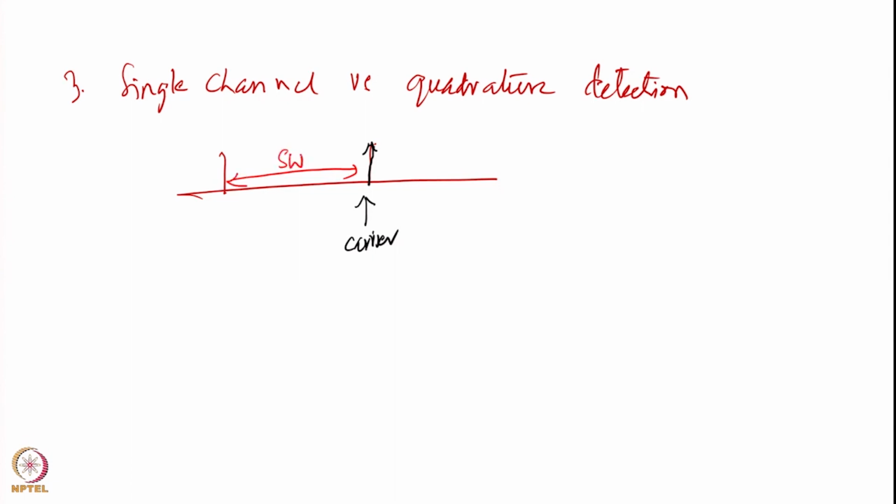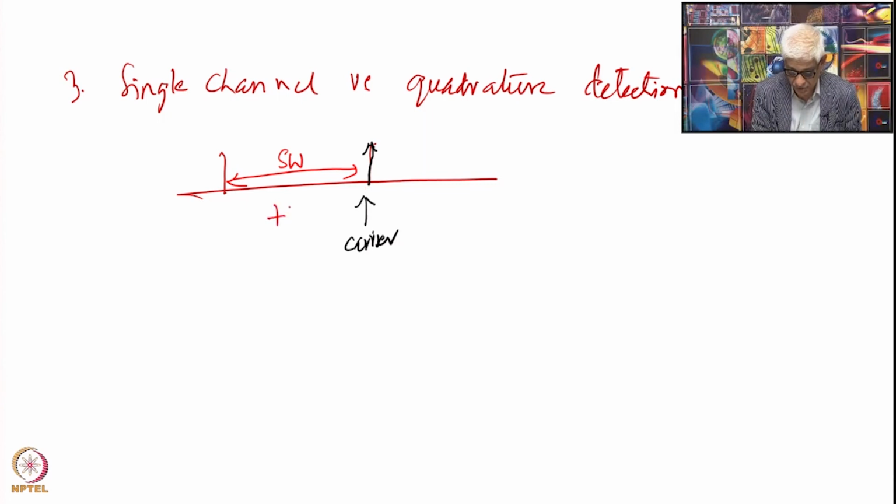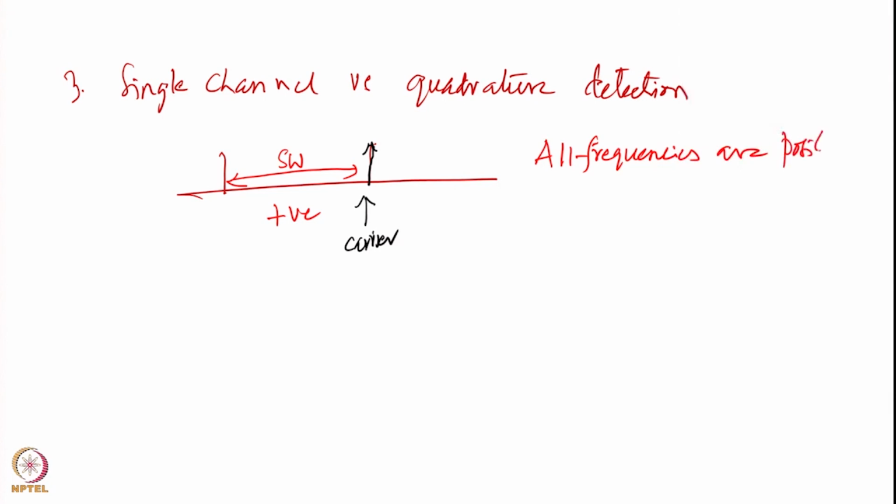With respect to the carrier, let us say this is positive, all frequencies are positive.